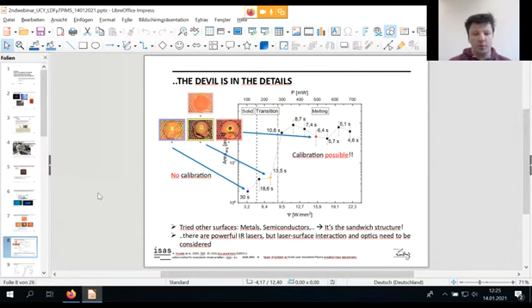I also did one experiment which I can't show you here, where I used a lower laser intensity and applied this laser for, let's say, 1 hour to the surface. Then I increased the laser intensity a little bit for like 2 seconds, and I got a really high ion signal. That was the moment we realized that maybe this isn't a question of how long you apply the laser to the surface, but at what speed in terms of laser stability, and how high your laser intensity is. So there are two factors in the end: surface temperature and the gradient, how fast the laser is coupled to the surface.